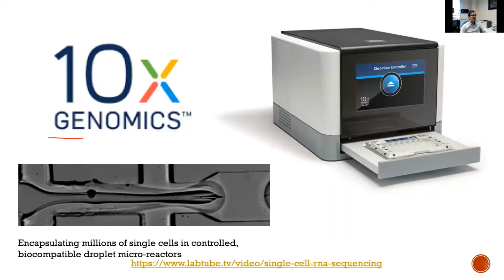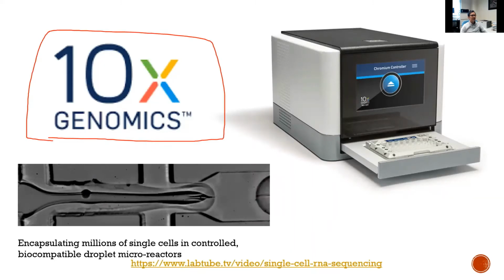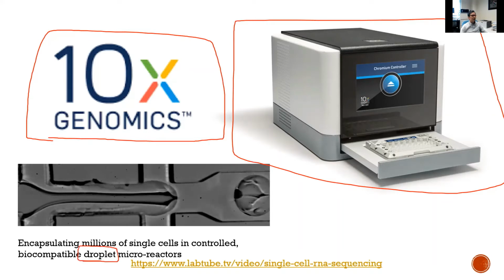10x Genomics is a company in California, and they introduced this small device called the 10x Genomics Chromium Controller. This is a device to help you separate individual cells and prepare the library for them. So that's the technology used here. It's called a droplet. You see, the know-how of this technology is to use partition oil to capture individual cells to make them separate.